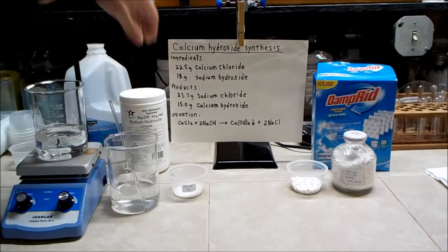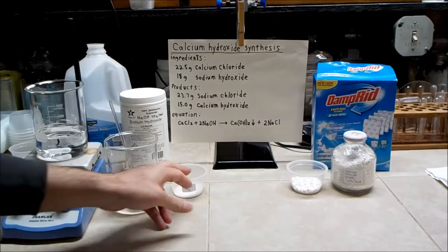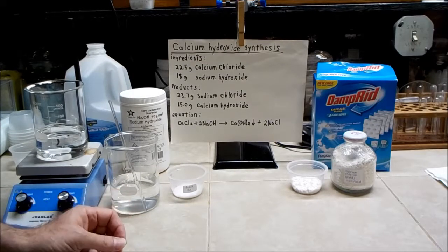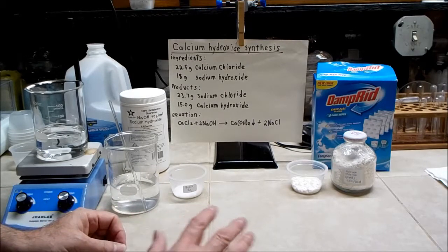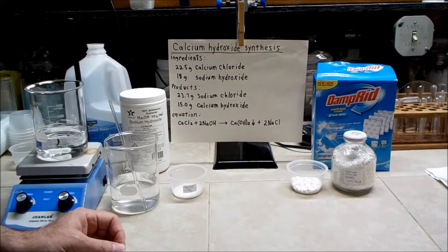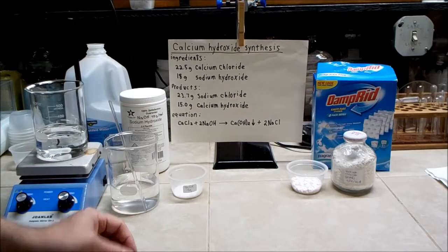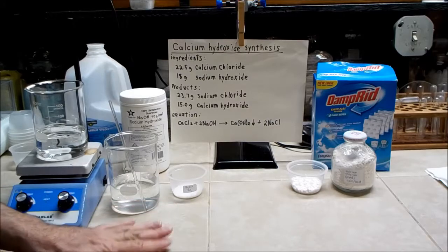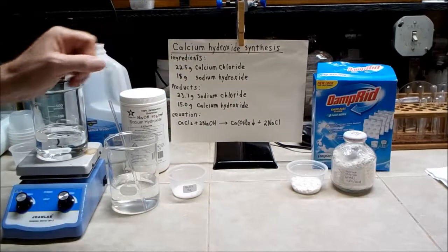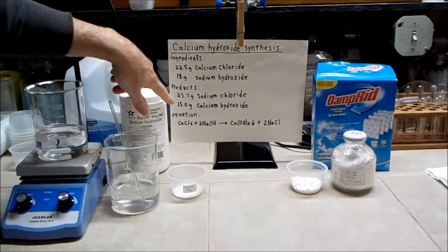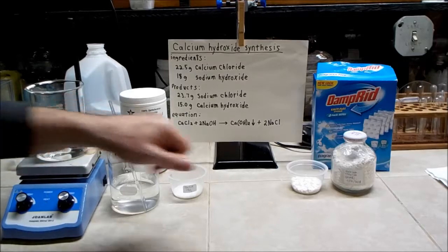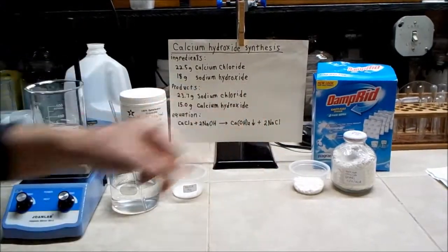Here I have 18 grams of sodium hydroxide, and it's an excess of 10% to allow for the likely amount of water that may be included. Now the amounts aren't critical, so if they don't balance exactly, the reaction should still be fine because the only thing that will precipitate is the desired product, calcium hydroxide. I should be getting about 15 grams if this goes according to plan, and here's the balanced equation down here.